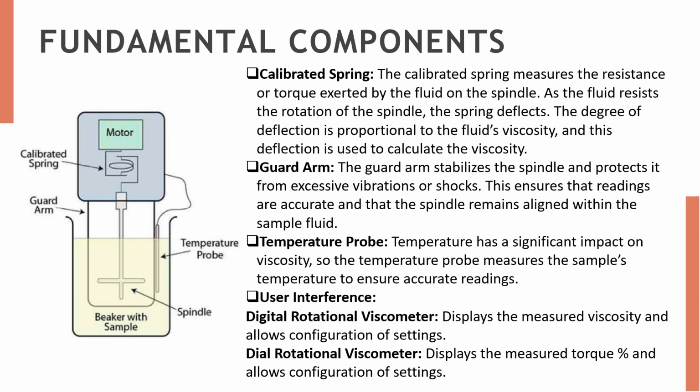So, our next component is the calibrated spring. The calibrated spring measures the resistance or torque exerted by the fluid on the spindle. As the fluid resists the rotation of the spindle, the spring deflects. The degree of deflection is proportional to the fluid's viscosity and this deflection is used to calculate the viscosity.